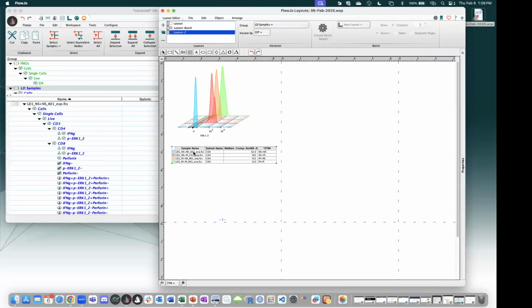So if you just overlay two samples, and one is always going to be a control, and you always want that control to be there, for example, if you're doing a GFP experiment and you always want to have your wild type overlay with your actual sample, you can just select that universal control, right click on it, and click on set as control. Not gonna work today.